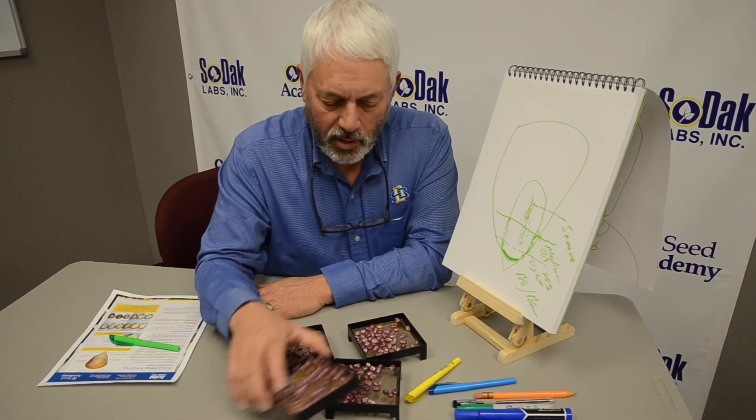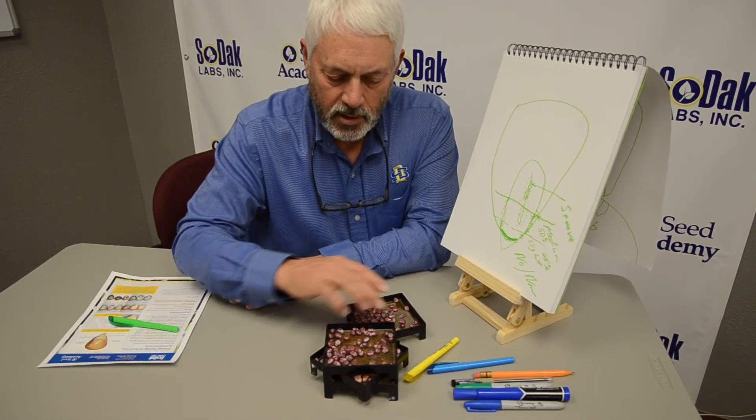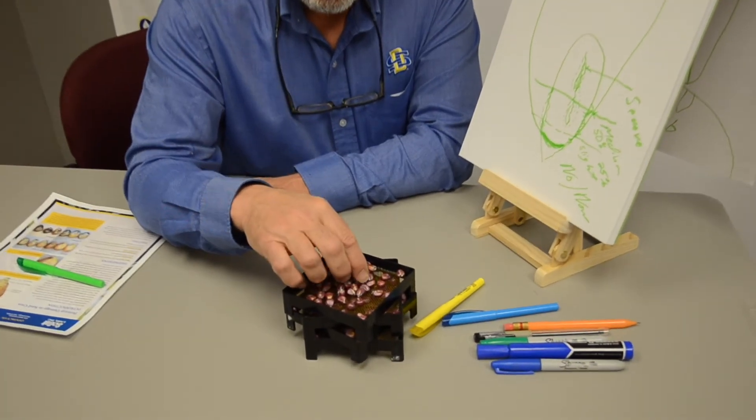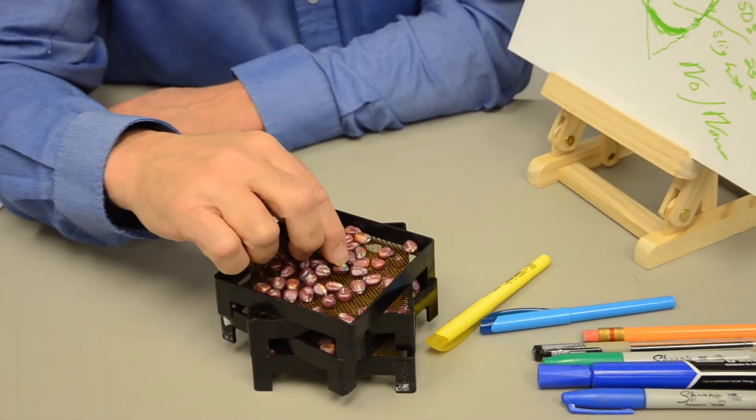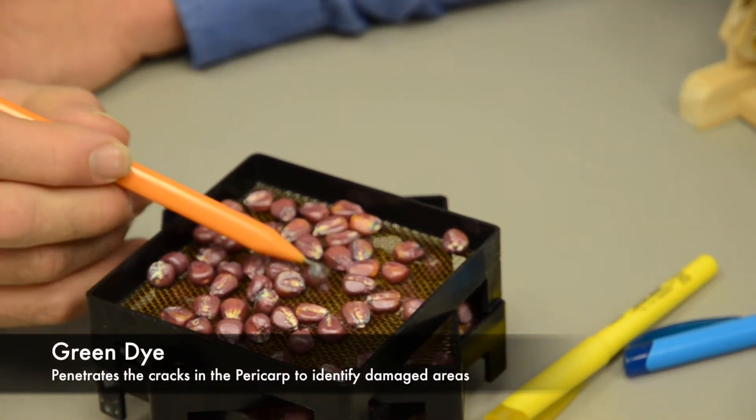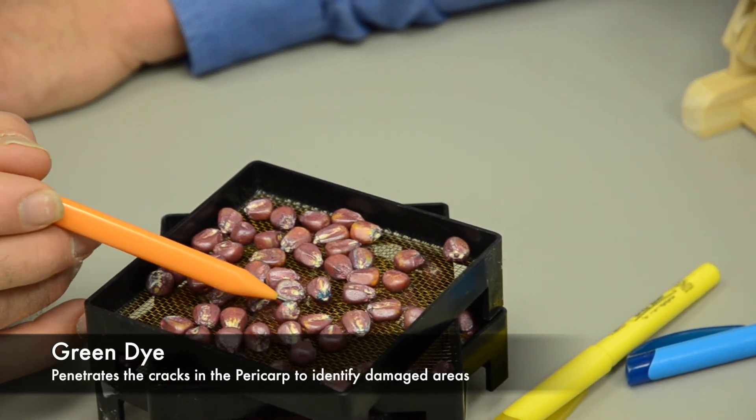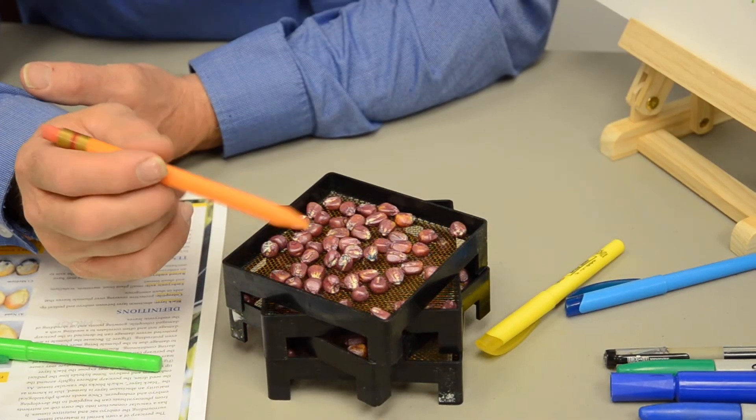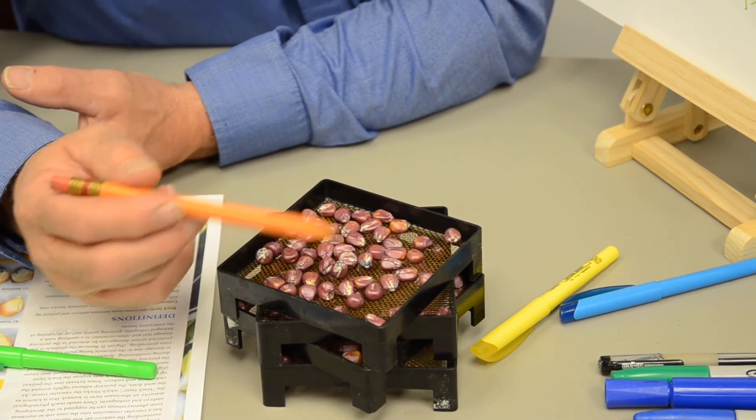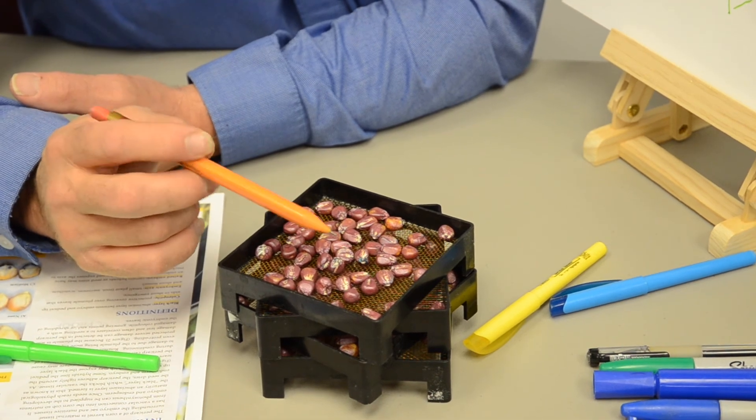We count out 50 seeds, four reps of 50 seeds, and then we actually put these seeds in a dye. I know you won't be able to really see this, but what the dye does is it penetrates the pericarp and we'll get staining. When we're evaluating this, we take the kernels and put them under three to five power after they've been stained, and we look for damage.